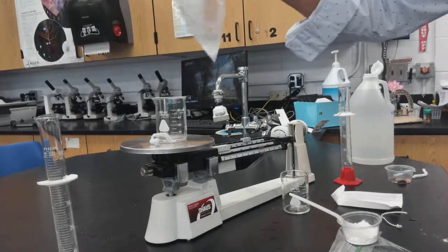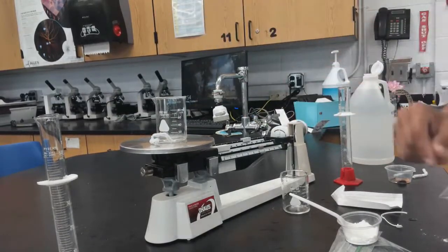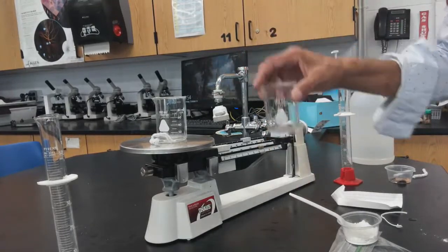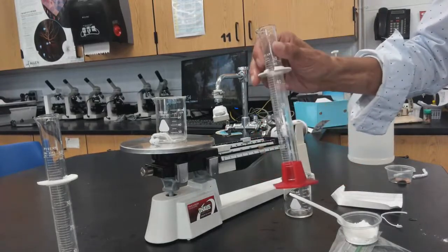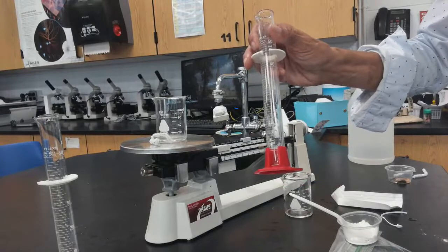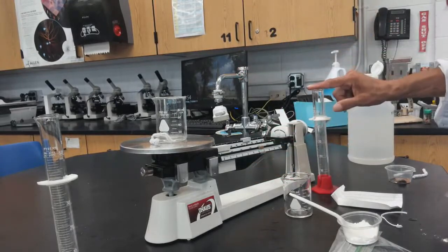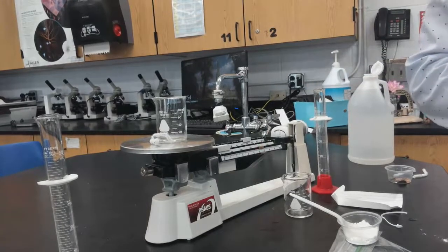When you're done, you can throw the bag in the garbage. The pipe cleaner should stay. Clean both beakers and wash and dry the graduated cylinder. Then wash your hands using soap and water.